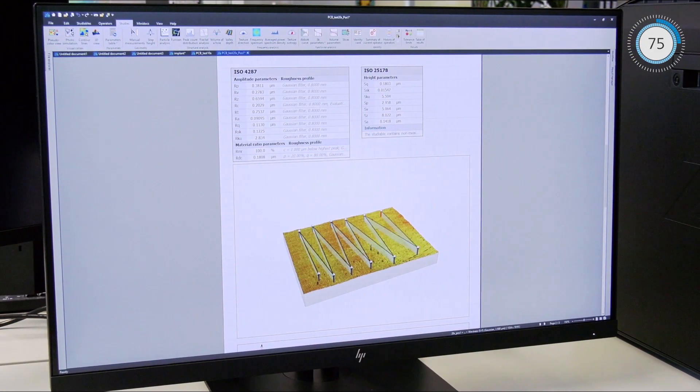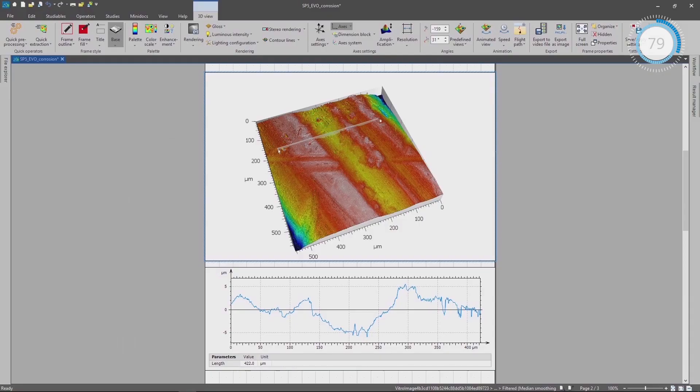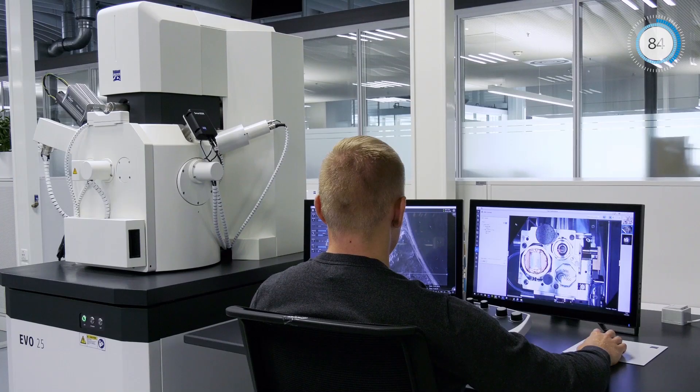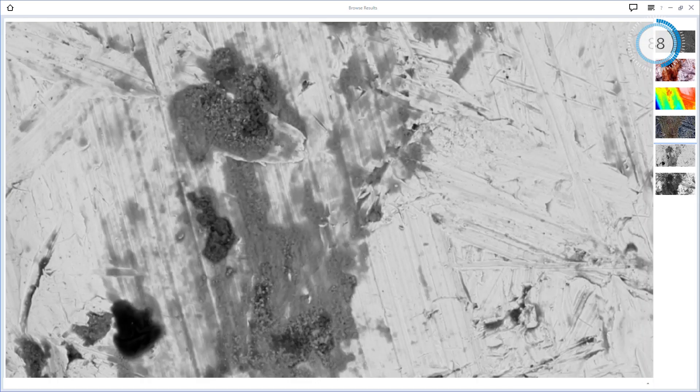Measure geometrical parameters and carry out roughness analysis based on industry standards. Enable correlative workflows and separate imaging from post-acquisition analyses.